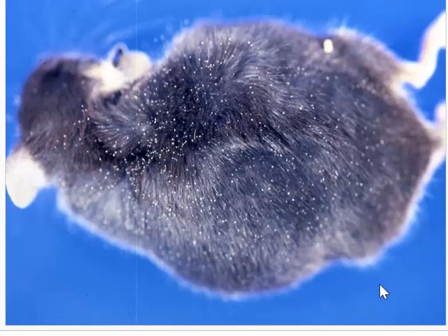Usually the infection with lice in most species is going to be totally innocuous and unseen. And then if you have a mouse that you're posting for any other reason and you put it on the light tray and you walk away for a couple minutes, you may come back and the lice, which normally are adherent to the skin, have noticed that the light source is warmer than the body of the cooling out animal, so they will climb up, as we see right here, to the ends of the hair.